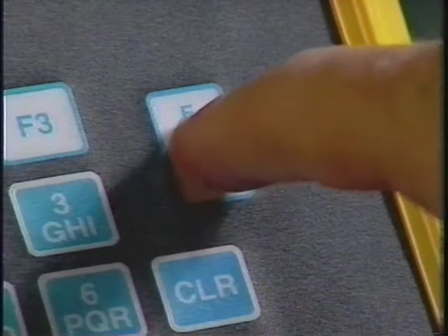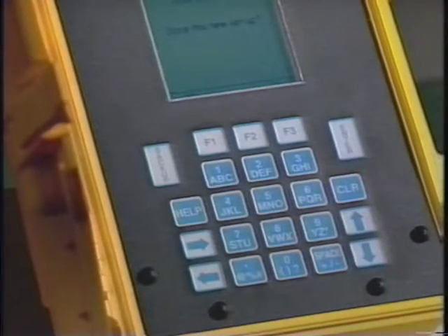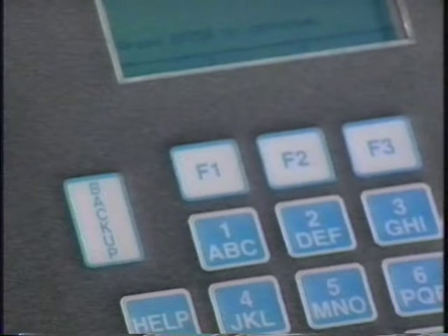Select among the choices in the sensor field until the desired sensor is displayed. Refer to your owner's manual to add additional sensors to this list. Press Enter. A screen appears asking if you'd like to store this new setup. Press F1 to accept and store the setup.